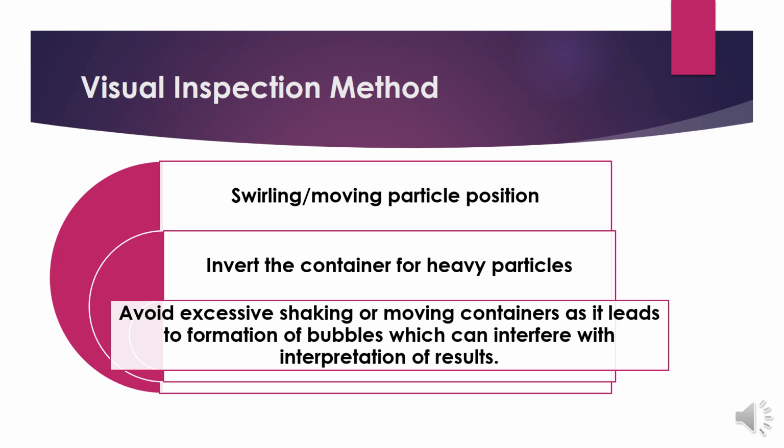So you have to be very careful while performing this test. You should not provide extra movements or shaking to the container, which may create bubbles.